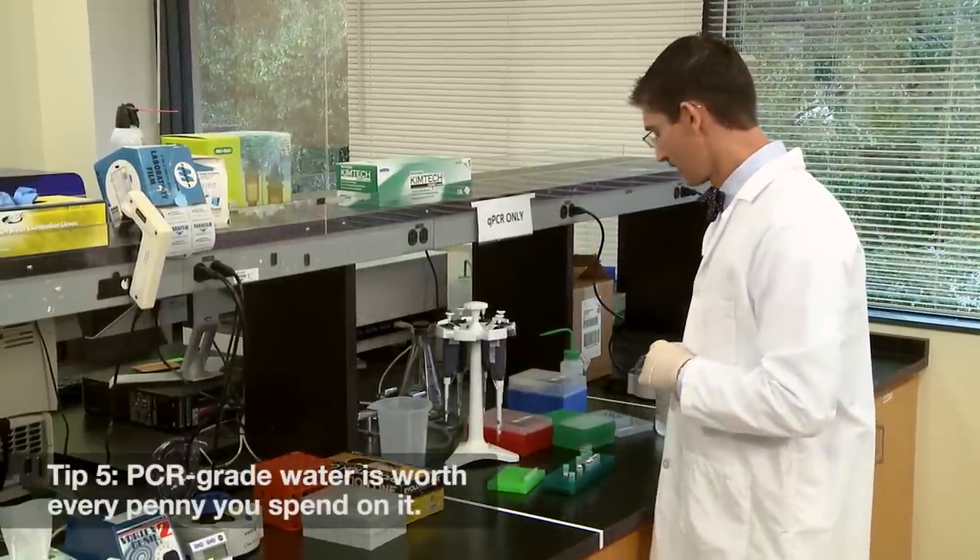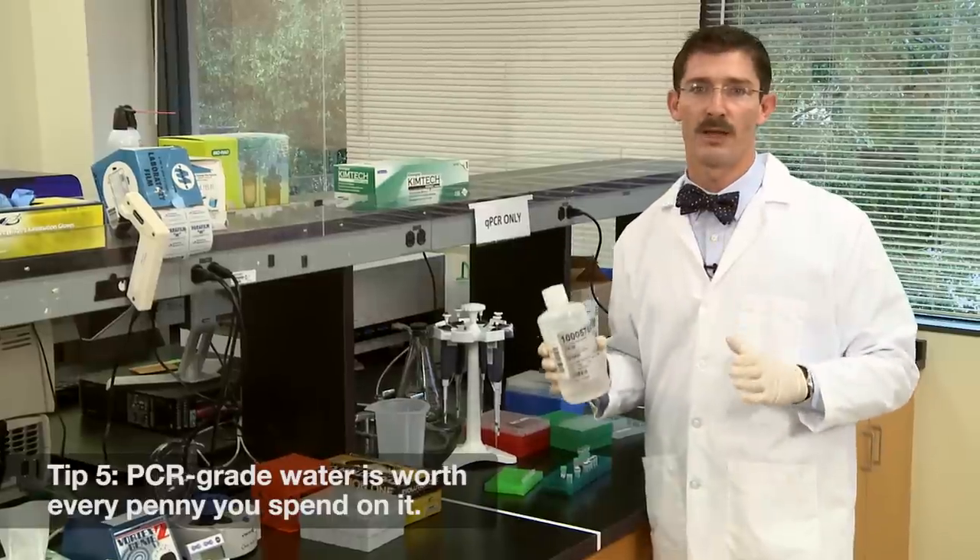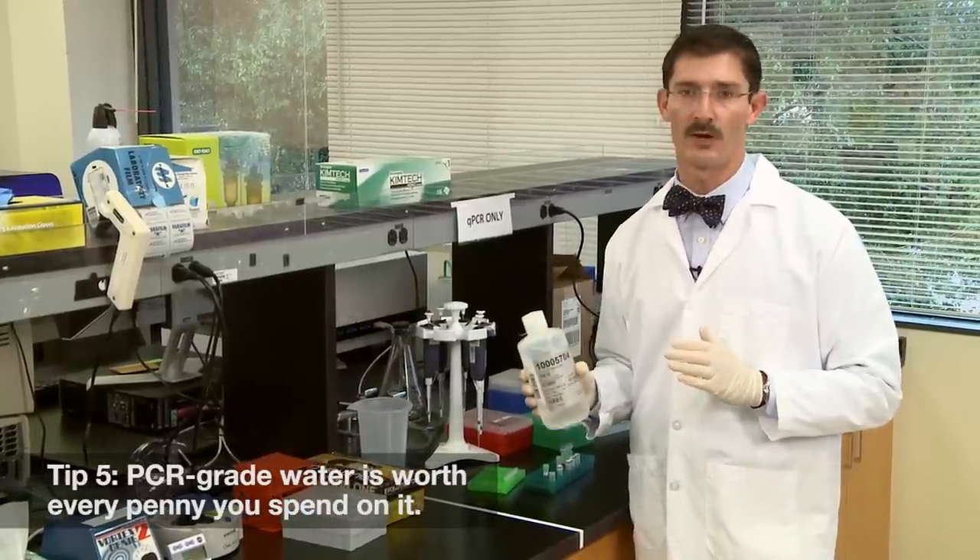And trust us, you will not regret the money you spend on PCR grade water.